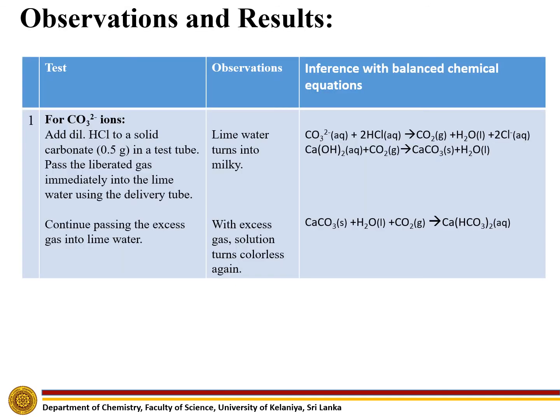Observations and results. When we add dilute hydrochloric acid to the given carbonate ion powder, we can see a gas evolves, which is carbon dioxide. Carbon dioxide can turn the lime water milky.